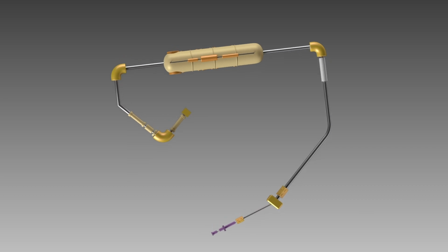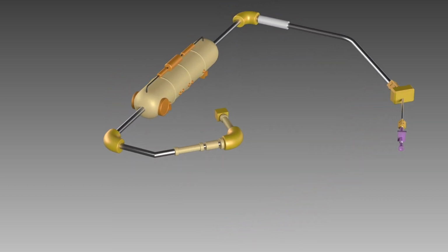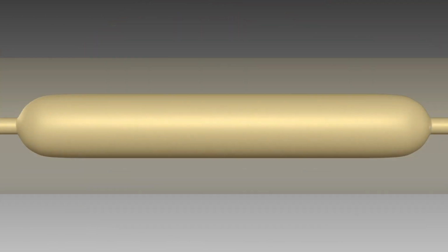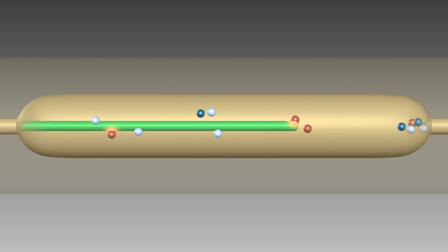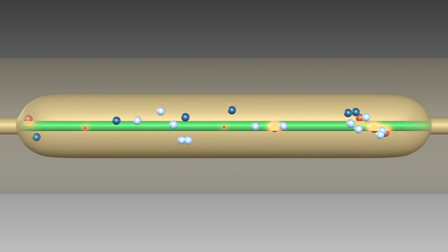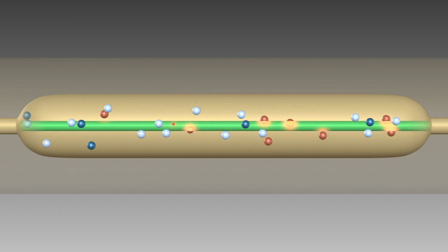A special feature has recently been developed to improve AMS. In ion laser interaction mass spectrometry, or ILIAMS, negative ions from the ion source are slowed down by collisions with a buffer gas, such as helium, giving ions time to interact with the laser or gas, and the unwanted negative ions become neutralized. Hence, the magnesium cannot reach the detector.